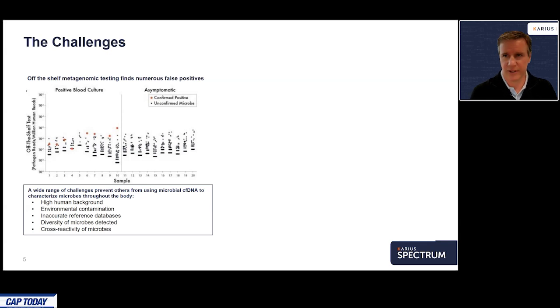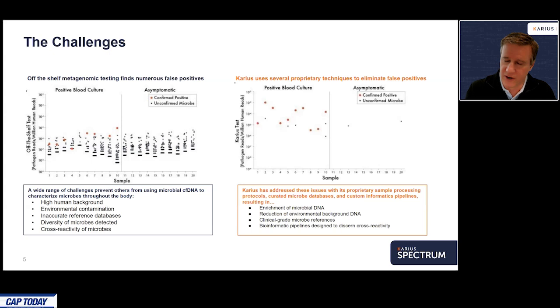It's always a mixture of dozens to hundreds of species, and those genomes share significant portions of sequence. And we want to develop the compute algorithms to accurately dissect which microbes are contributing to that mixed population of signal. So, of course, we wouldn't be talking today if we hadn't actually done all of that.